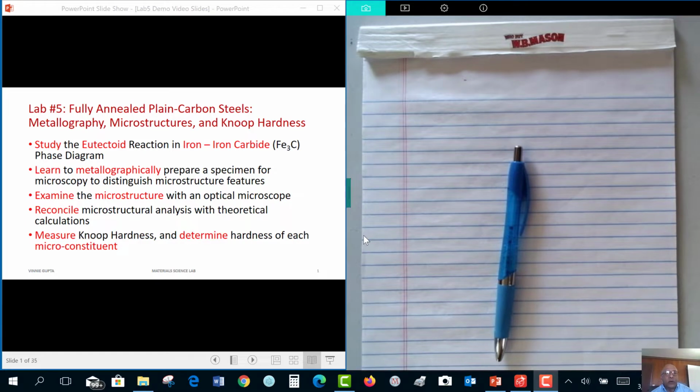We are in lab number 5. In this lab, we are going to discuss fully annealed plain carbon steels. So, we are going to talk about metallography, microstructures, and Knoop hardness. I'm going to break the video up in 3 parts.